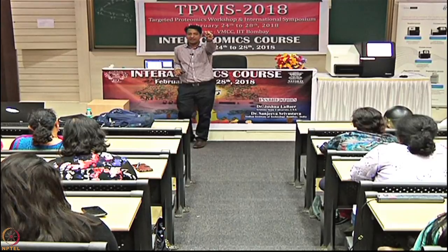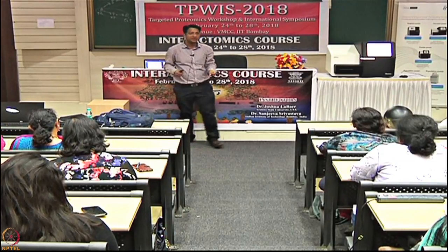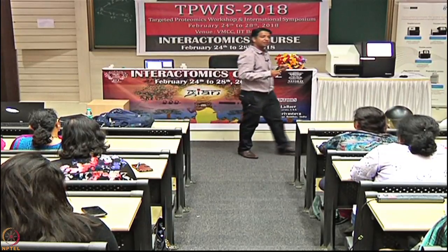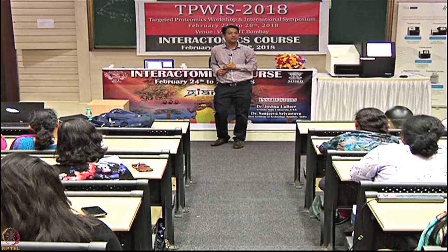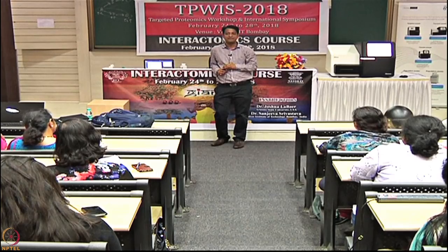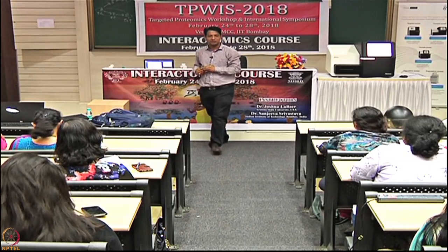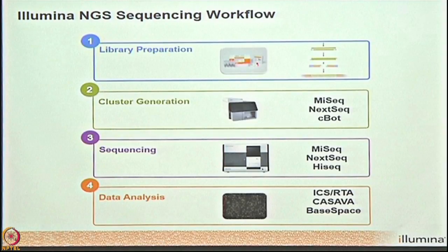So, if you wish to sequence a human genome, do you wish to invest 10 more years? No. With the help of NGS technologies, you can sequence 50 human genomes in a span of 48 hours. How many? 50 human genomes in a span of 48 hours. So the key idea remains the same. The principle remains the same.